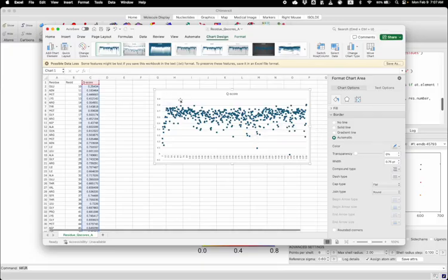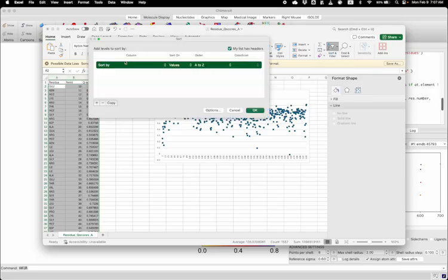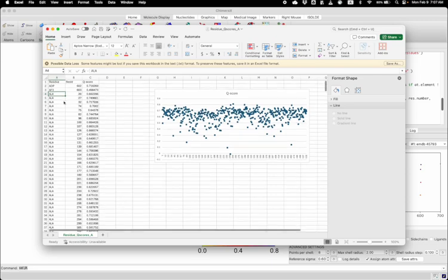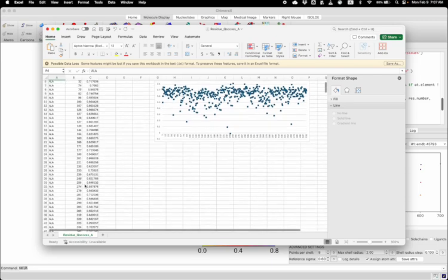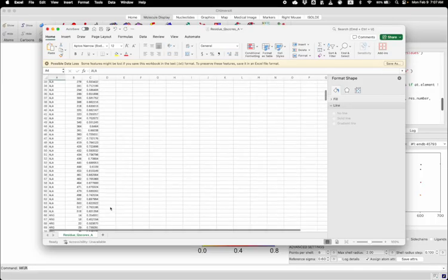What we'd like you to do for the exercise is to look at some statistics for residues of different residue types. For example, in Excel, I can sort these by the residue name. Now I have all of the residues sorted by name. I can average, for example, all of the Q scores for the alanine.